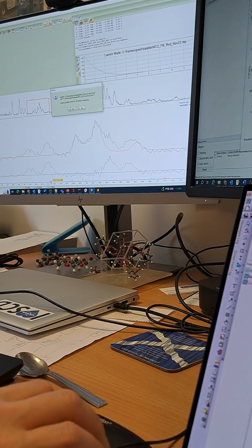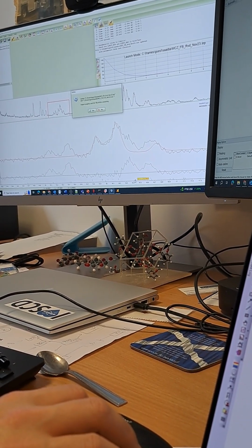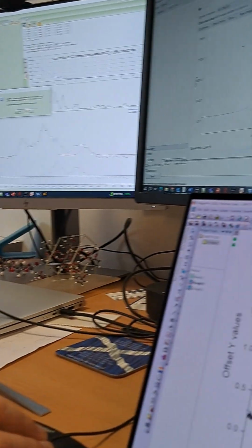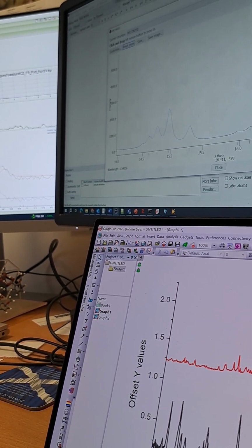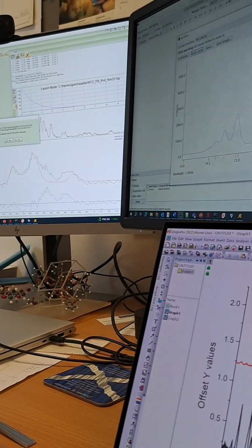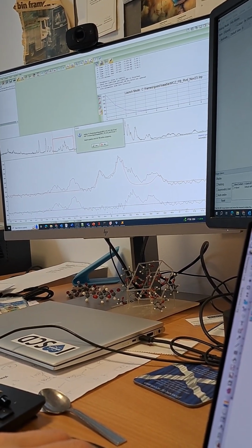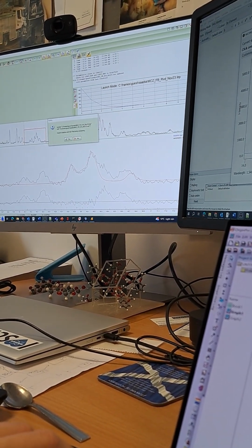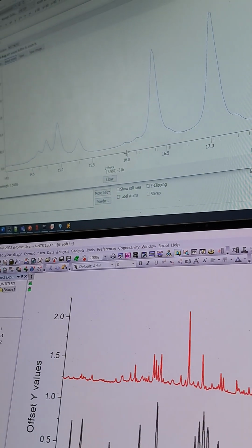Okay, 130 and 132. So that's maybe gone perhaps a little high, but we'll see. 042, what's that? Is that anywhere? We need to maybe reset zoom. And 042, yeah, 042 is this tiny little thing. 111. What's this one? 121. 061. I saw 6 somewhere. Where did I see 061? Oh, I saw that one there.